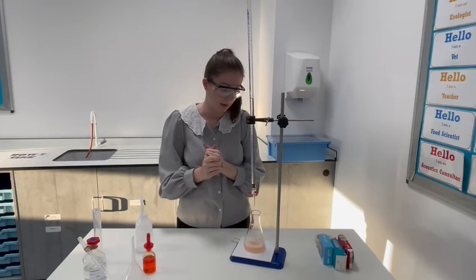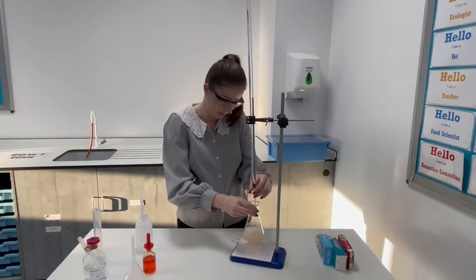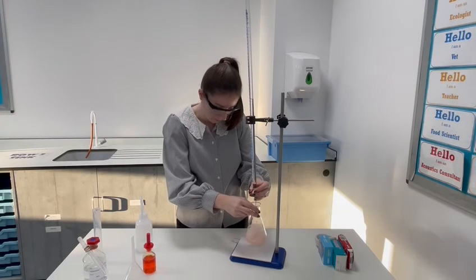So now that my indicator has changed colour, oh, not quite, add another drop, oops.